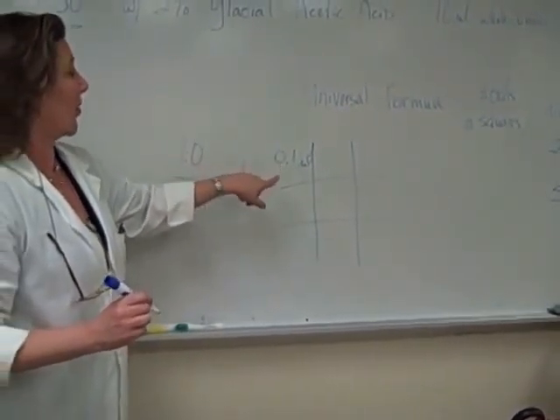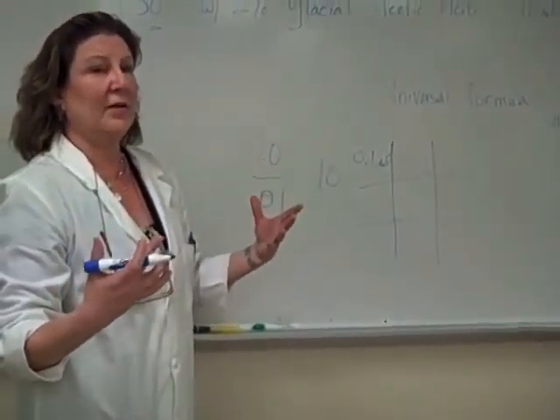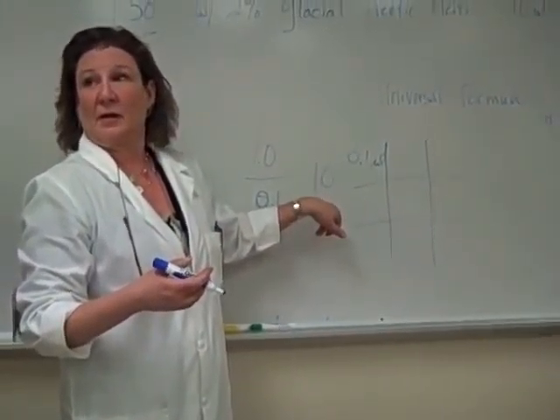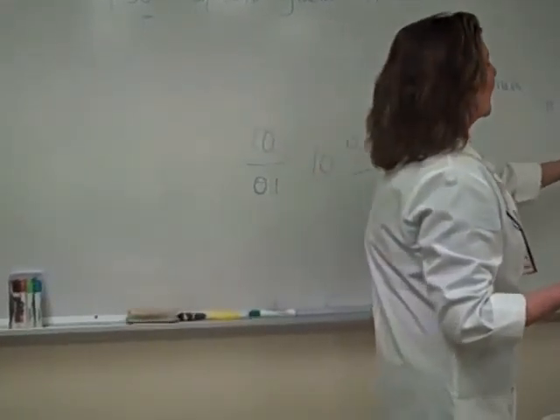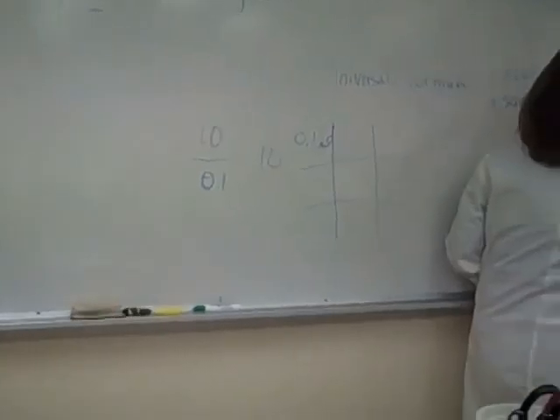Okay? So I'm compensating for not counting the whole entire square if I just count 1 square by multiplying my calculation by 10. So the volume correction factor that we're going to use today is going to be 10.